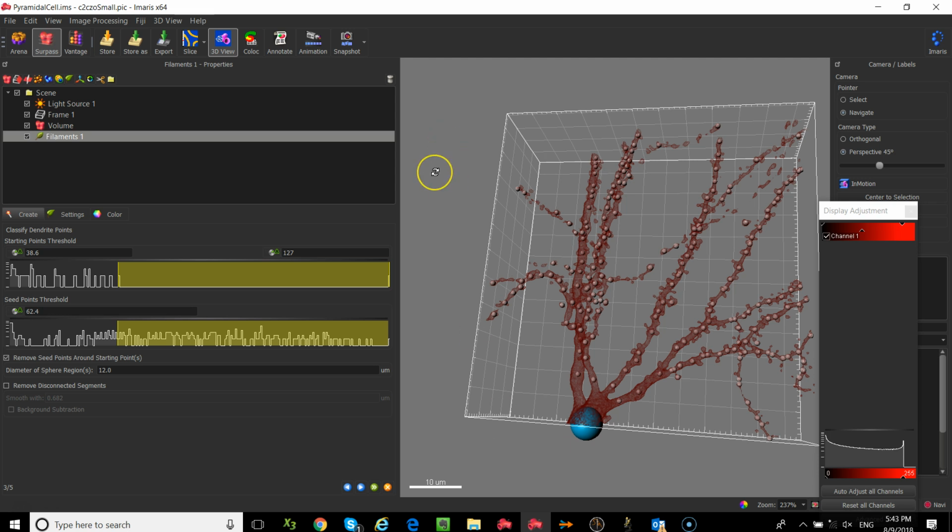Okay, so if you have multiple individual cells in your field of view, will it calculate? Absolutely. You just need to make sure that every cell has a start position inside of it. If you forget one, it will think that projections from another cell belong to the neighboring cell. So you really need to make sure you have a start position in every single cell body.